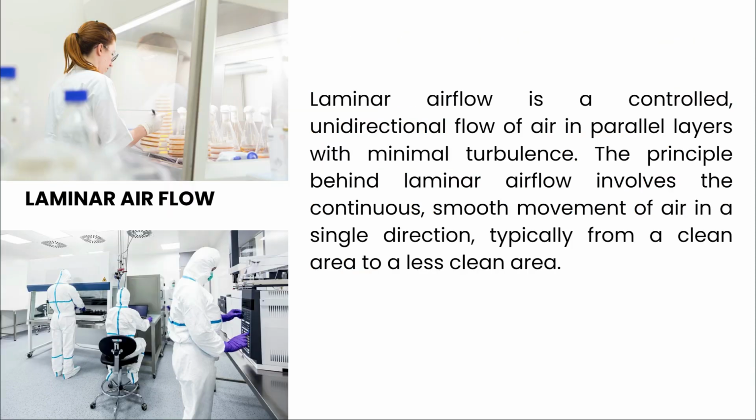Laminar airflow. Laminar airflow is a chamber which maintains a sterile environment. While you are working with microorganisms, safety plays a very important role. And in order to create a safe and aseptic environment, all the microbiological experiments are carried out within laminar airflow.